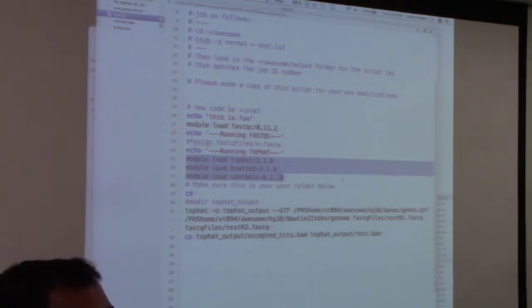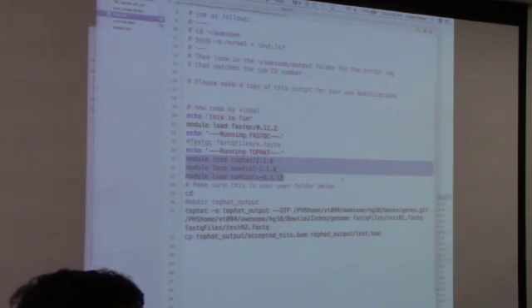Once you see those files, I want you to pick one gene of interest that you have and compare the read profiles for those genes. Maybe say across one area, across an exon, and see if these two aligners give you the same number of reads in that particular region just by eye. If you eyeball it, does it look like they're similar or do they look different for your gene of interest?